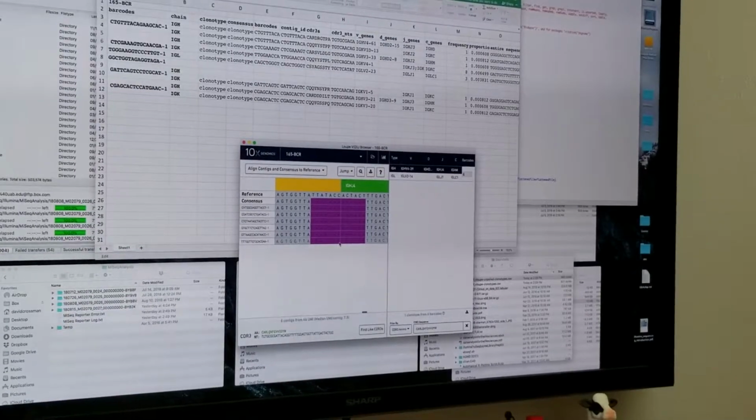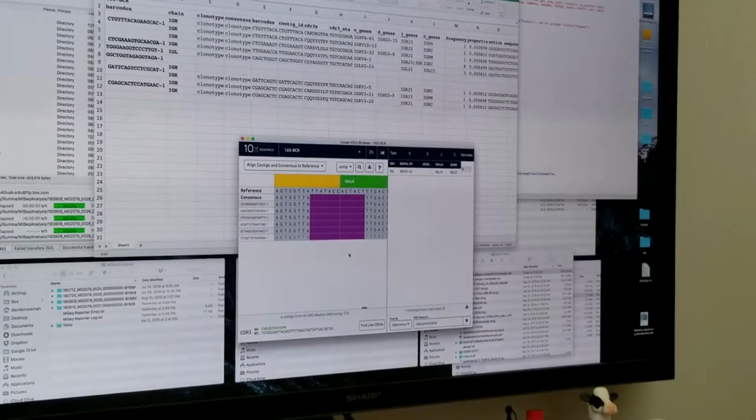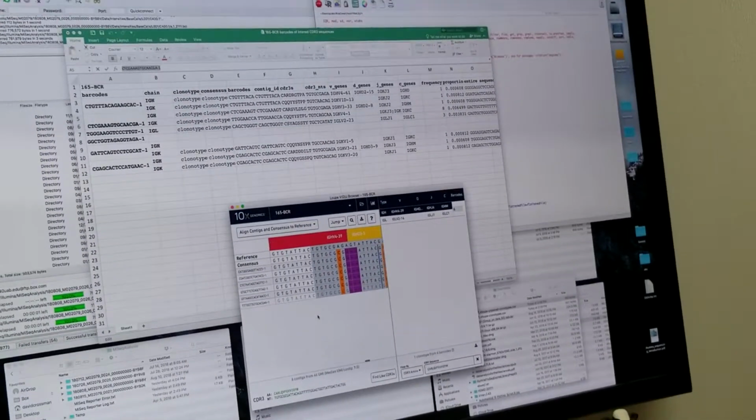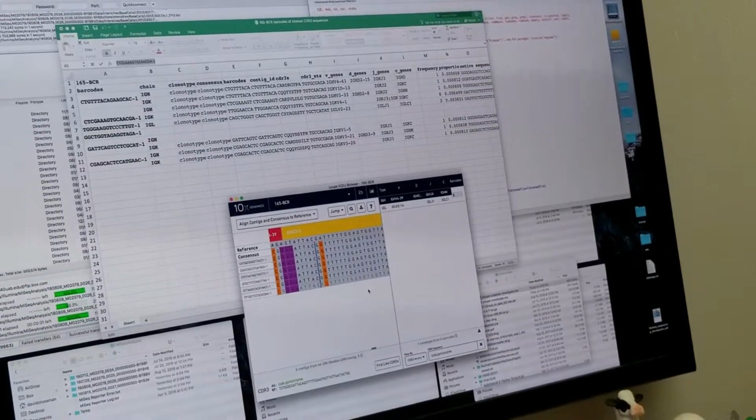I wonder what that means. I mean, it looks like there's always these big... Now they move around. Right, they do. I mean, the other one we were just looking at, the deletions were all right here at the front of the D.